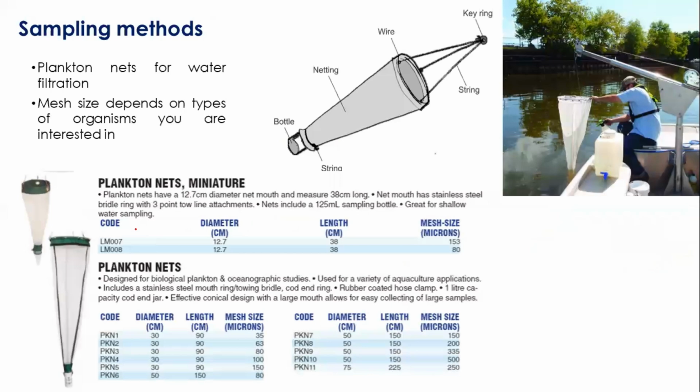The sampling method for marine microbiology is the very first step in understanding marine microbes, right? The easiest way is to put the plankton net in the water and do the filtration. You can see that one researcher is ready in the boat with the net.